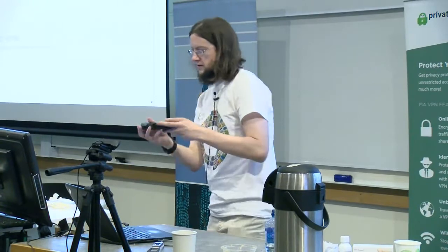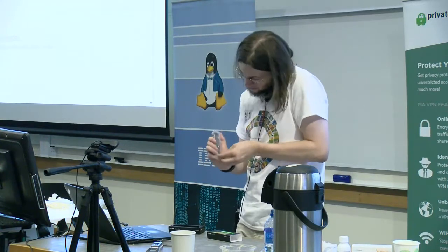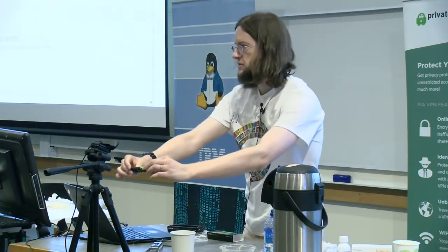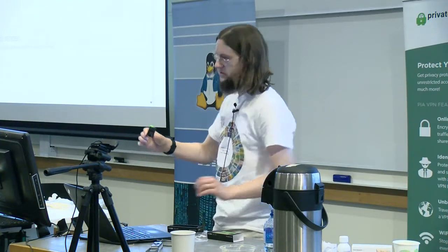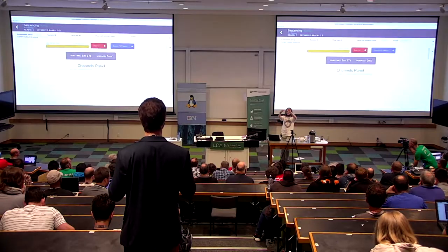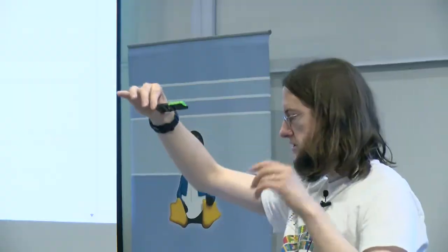So the sequencer itself, we have these. Got another one here. Sorry, I've killed my webcam software. This is the tiny thing that does the business of the sequencing. So that goes into the sequencing device.